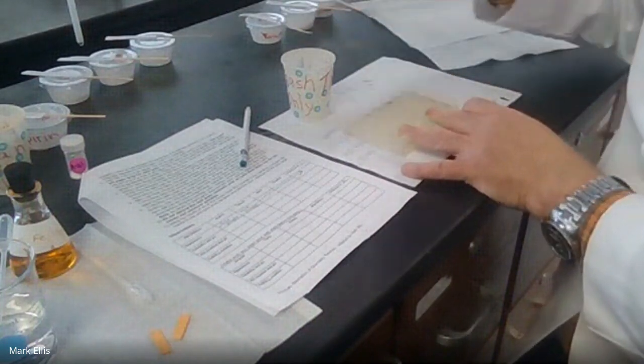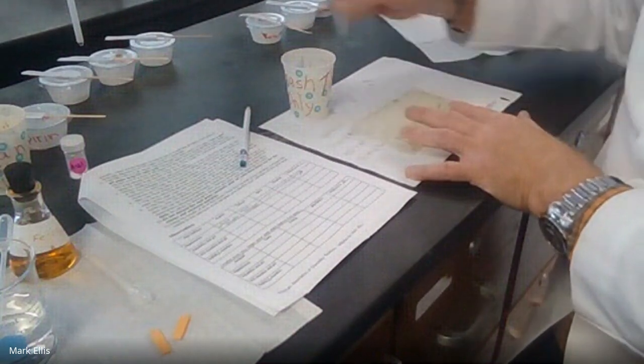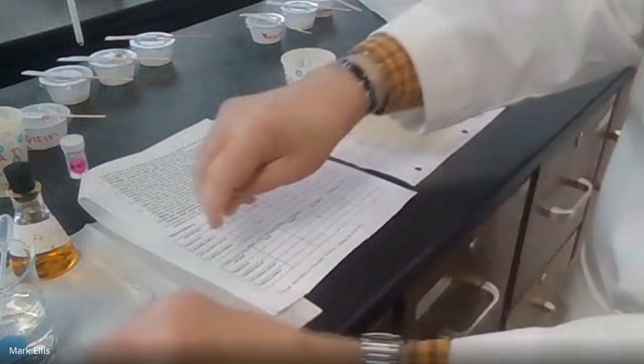Done. Throw it away. Fourth column, second row, stir, stir, stir. So if I had a lab partner, they could be breaking off a couple more Q-tips or toothpicks for me. And I'll just do it here. I got 3 of them here. Break those in half, so I got a nice, good flat spot.